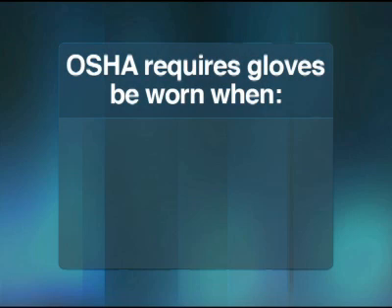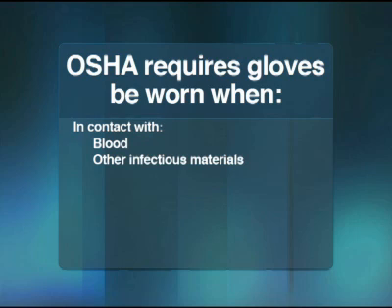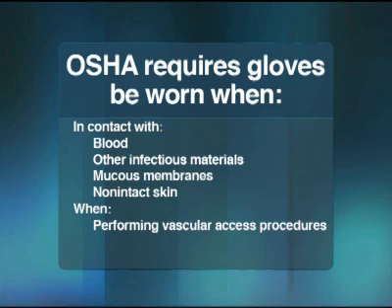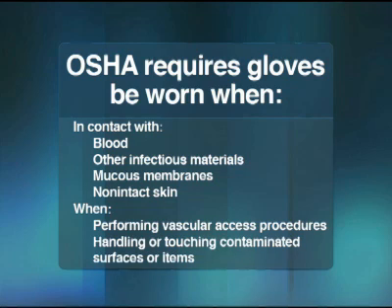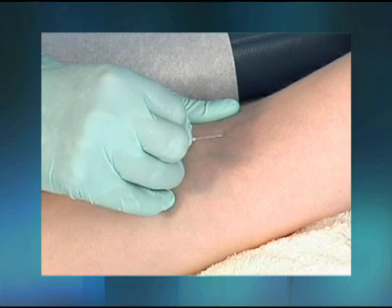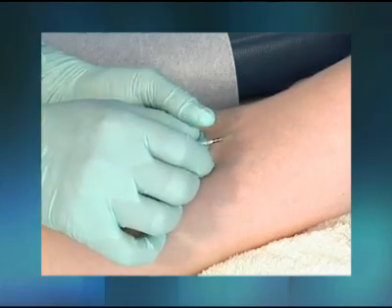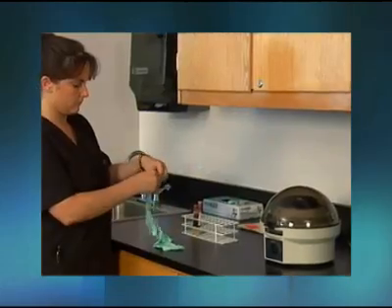OSHA requires that you wear gloves when it is anticipated that your hands will have contact with blood or other potentially infectious materials, mucous membranes, non-intact skin, when performing vascular access procedures, and when handling or touching contaminated surfaces or items. When would this happen? Examples are giving an injection, performing a venipuncture, or cleaning a laboratory countertop that has blood on it.